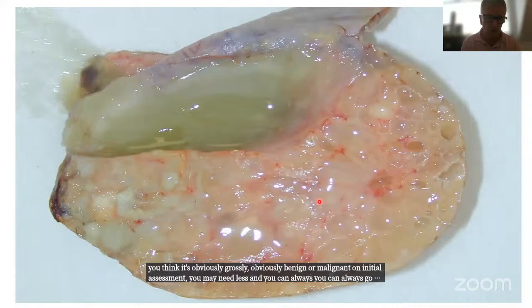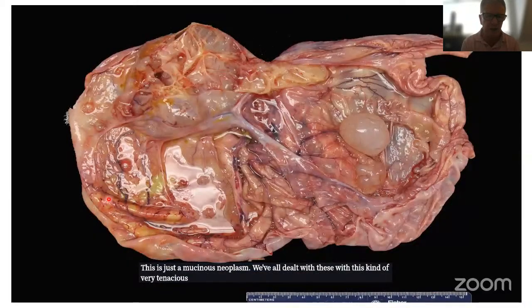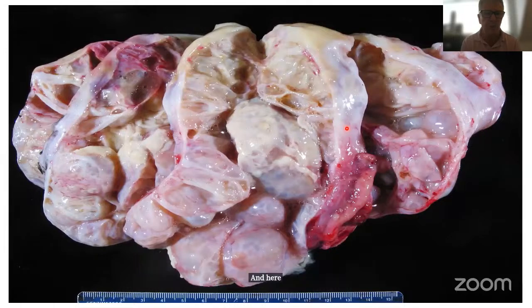This is just a mucinous neoplasm. We've all dealt with these, with this kind of very tenacious mucoid material. And here's one with lots of locules, and you really need to open up all the locules to look for more solid areas. And here's a mucinous carcinoma becoming more solid looking.